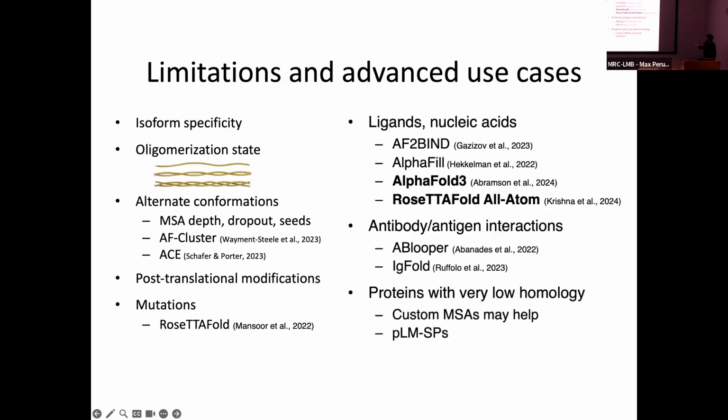Ligands and nucleic acids used to be a problem, as we said, because AlphaFold 2 cannot accept them. But these days, we have AlphaFold 3. Also, there is RoseTTAFold All-Atom, which can accept ligands and nucleic acids. Again, how well it works, you'll have to try yourself.